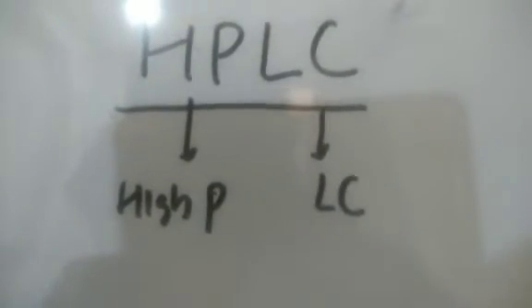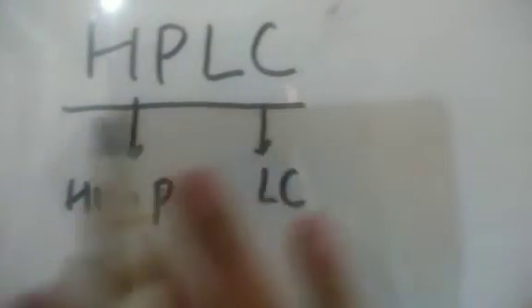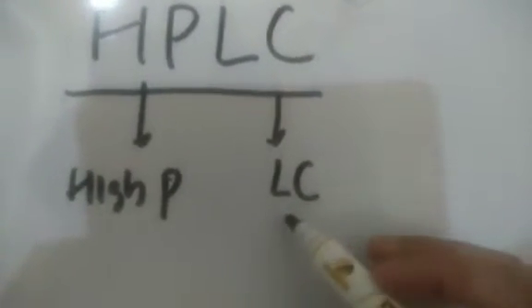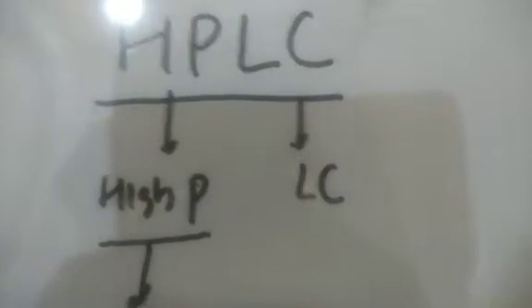chromatography. जैसे मैंने लास्ट क्लास में हमने कहा था, सो प्लीज गो थ्रू दैट, कि उसमें हमने कहा था लिक्विड क्रोमेटोग्राफी में इन जनरल वी कैन टेक बेस्ट एग्जांपल ऑफ कॉलम क्रोमेटोग्राफी, क्योंकि हम वो लैब में भी करते हैं और बहुत कॉमन है. तो उसमें द मोबाइल फेज इज अ लिक्विड, usually polar, non-polar solvents, and stationary phase is silica gel, alumina. So this is actually the same. Basically HPLC is a liquid chromatography, similar in its basics to column chromatography, but there is an additional thing that is high pressure or high performance.